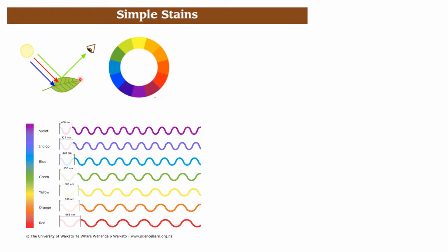So usually we use pigment for staining. In microbiology, we all know that under the microscope, if you want to view bacteria and some microorganisms, we need to do simple staining, at least simple staining. Why? Because under the microscope, they are too thin and appear colorless, so it's very difficult to see bacteria and other microbes under the microscope without stain.